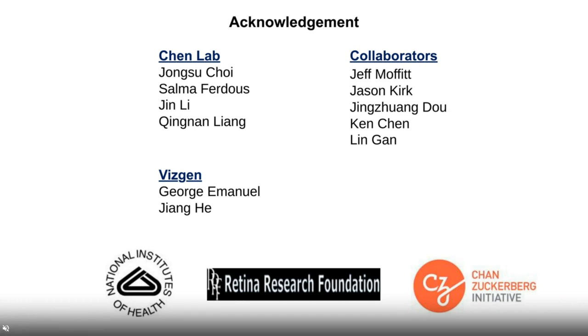How long does a single experiment take, assuming usage of the entire 1 cc imageable area, including both the imaging and hybridization washing steps that are performed on the machine? Yeah, so currently our protocol takes about 4 to 5 days from the time you section the tissue, start hybridization and clearing, to the imaging. I just want to say, it really takes 4 or 5 days, but the hands-on time is much less than that. Some days just a few hours, some days very fast.